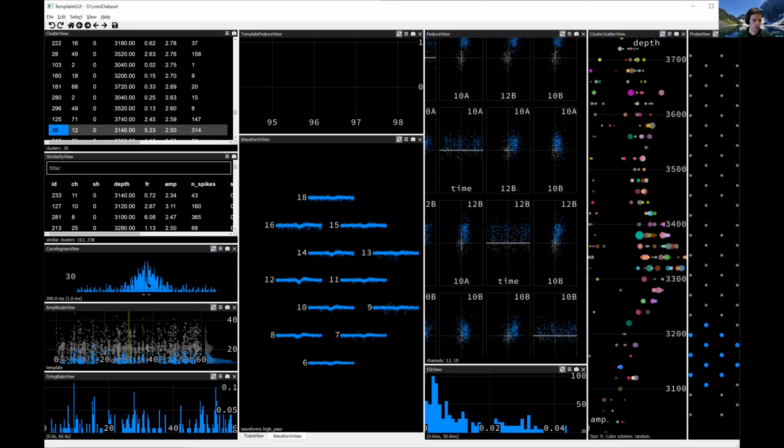And what this is referring to is the fact that real neurons have the property of having a refractory period. That means a real neuron cannot spike within a couple of milliseconds from the time it gave a different spike. So if it spiked at time 0.0, a real neuron will not spike within at least about 1.5 milliseconds from the time it spiked before.